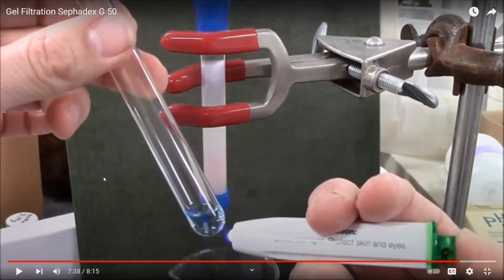Here there are two different compounds which are used, they have color, and one of which fluoresces in the presence of UV light. So when you pass the UV light, and if they fluoresce, then you know that it is a pure compound. So here he's checking whether the purity has been attained. Yes, he has been able to do that because there is color.